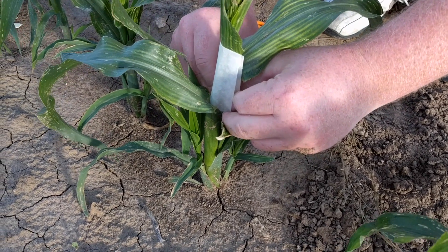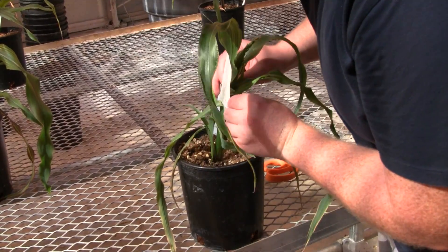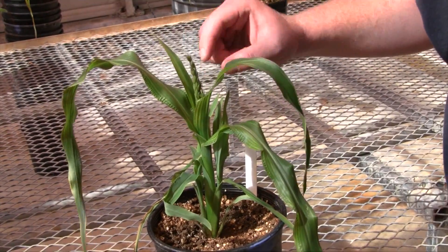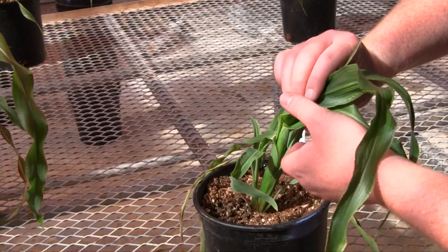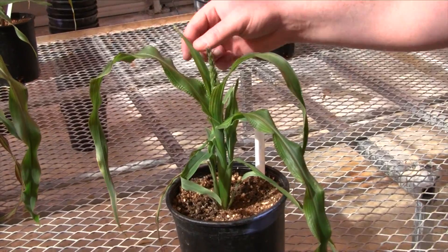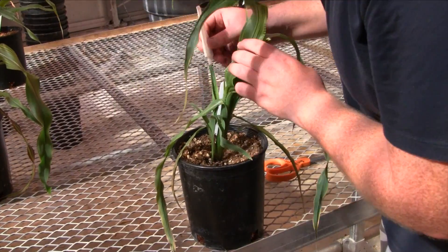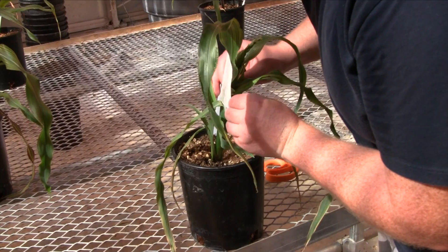Once in place, the earshoot bag should completely encompass the flag leaves so the earshoot and silks will grow into the bag. Ears emerging from the fifth node from the top are more common on plants that have a relatively small tassel flag leaf. If ear flag leaves are not visible at the fourth leaf node, gently pull the leaf away from the stalk and peer into the leaf sheath to confirm the absence of an ear. If no emerging ear leaves are visible, cover the earshoot of the fifth leaf node as previously described.